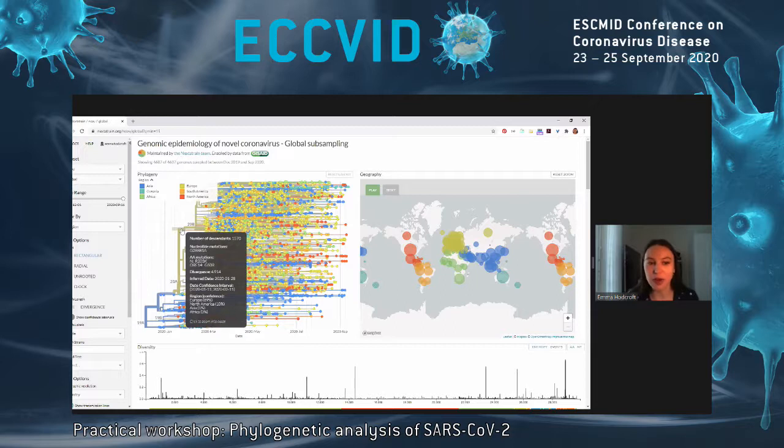We can also see when we estimate the date for that branch, when that branch diverged. And we can see that we've also tried to estimate what region this kind of hypothetical ancestral virus was in. So the ancestor here we infer was Europe, but it's always really important to keep in mind that when we make these inferences, we can only use the data that we have. And so we have to be really cautious here.